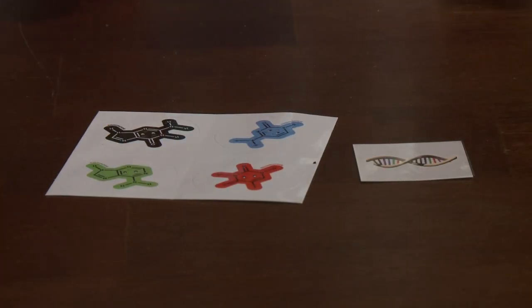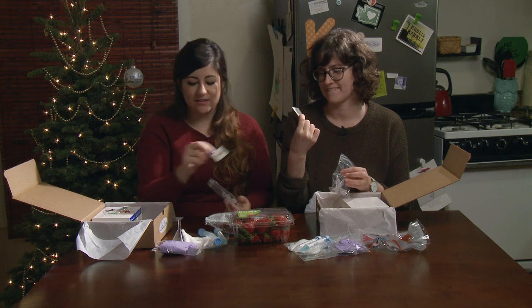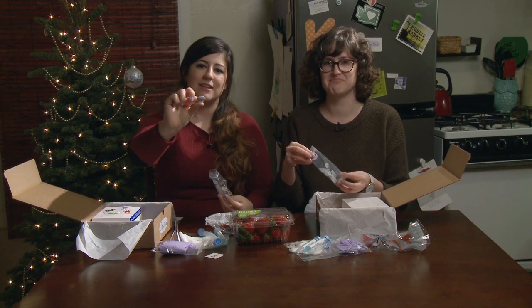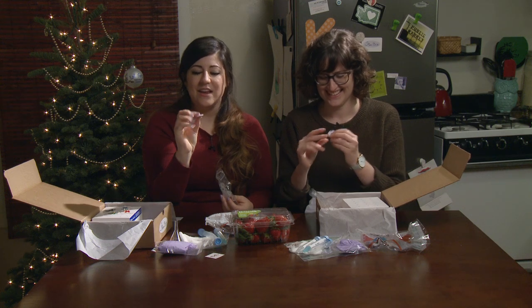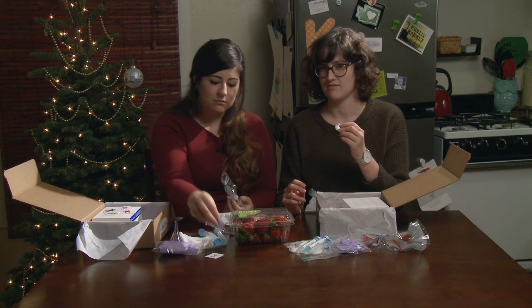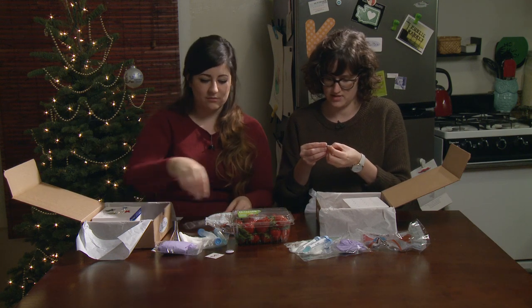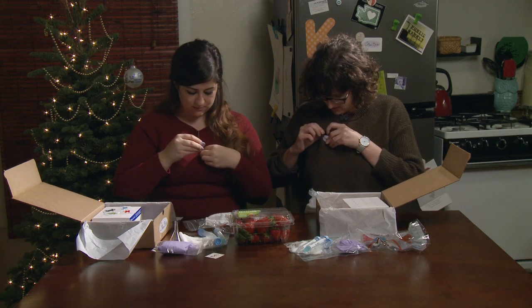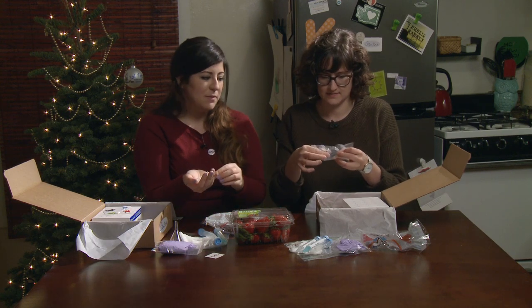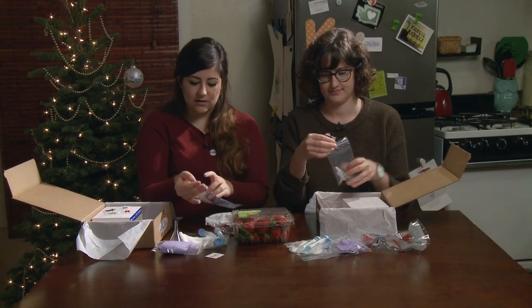We have tattoos — DNA tattoos. These are the double helix. To apply them, you just wet with a paper towel and read the instructions on the back. We have pins — they have a DNA helix on them. Every box comes with a pin, so wear your pin every time you do your experiment — they're like badges of science. We also have Eppendorf tubes. The name sounds funny but we use these in the lab all the time. They hold about one and a half mils of liquid, so just keep these to the side.